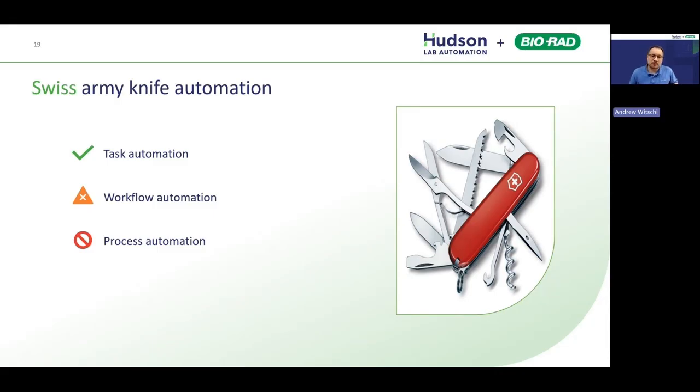In the workflow automation arena, right, you can imagine some of your research processes that are generic enough that you can reuse them for a bunch of different research needs, right? And that's not always a problem because you can do that. But basically, the more fixed purpose that you want to be on a system, it is impossible to support that if you want to do 10 other things on the system, right? So understanding that trade-off and making sure that you're well situated on it is important.